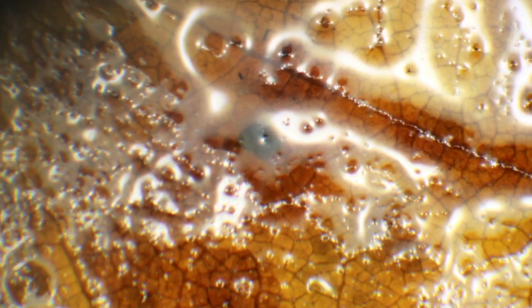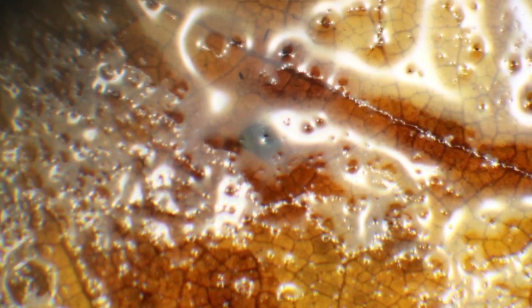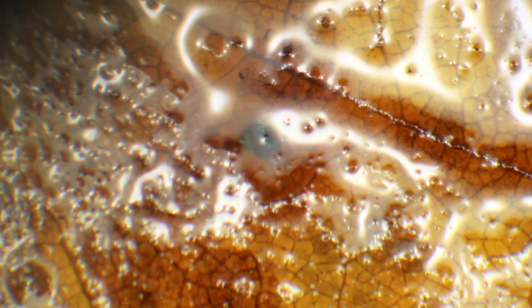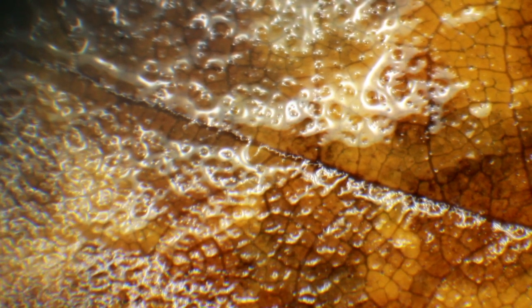All of a sudden I saw some kind of weird movement on the surface. Was the leaf moving? I could not see what the reason was for this strange movement, so I had to zoom in — and I could almost not believe what I saw. What you see here are tiny microscopic little worms. If you look very carefully, you can see them wiggle around. They're not pigmented, so they were clear, and for this reason they were quite difficult to see in the water. It appeared almost like the leaf itself was moving.